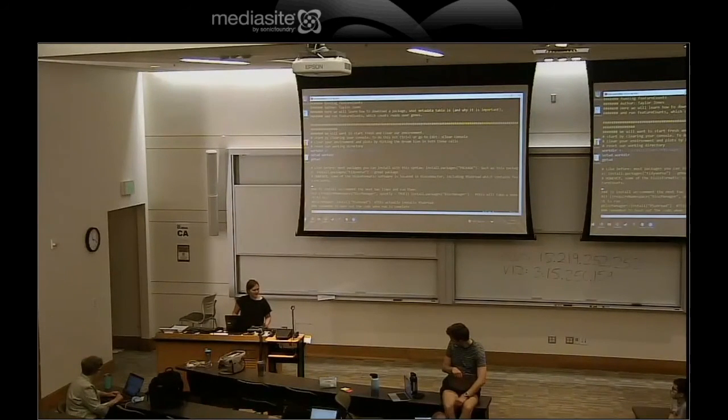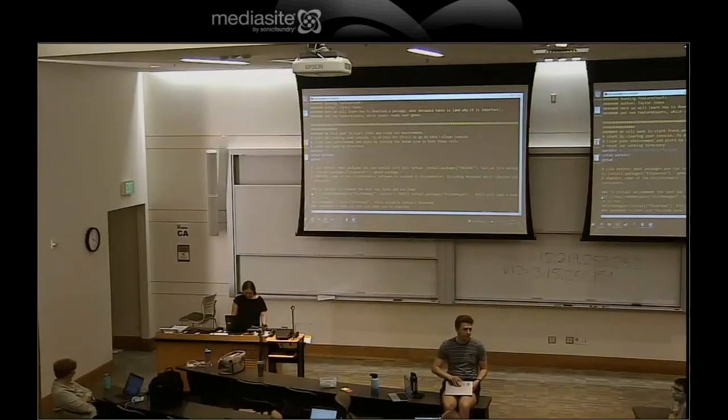How long do you think featureCounts takes? I mean, it depends on what you're doing, but like 2 to 5 minutes, assuming you're just looking at protein coding. Oh, I'm not just looking at protein coding genes. It depends what you're doing, right? So sometimes fast, sometimes longer.